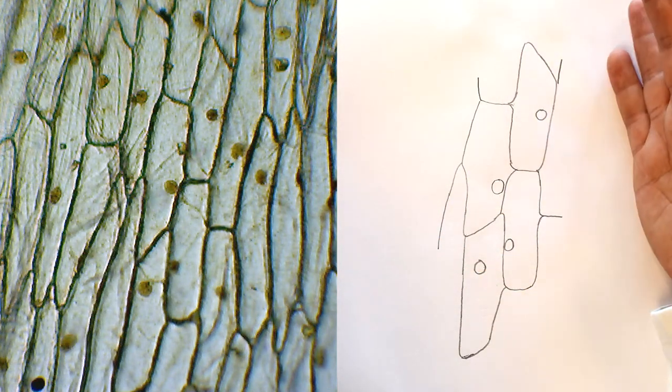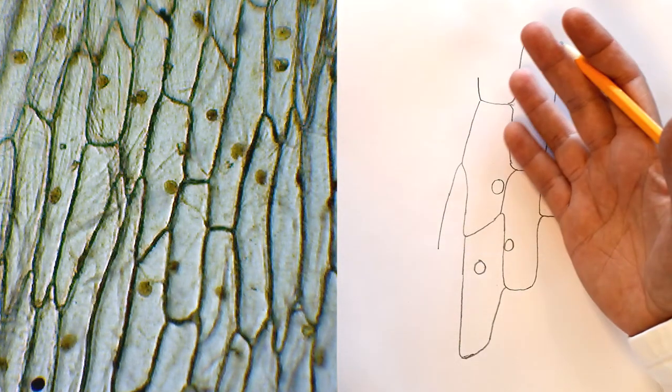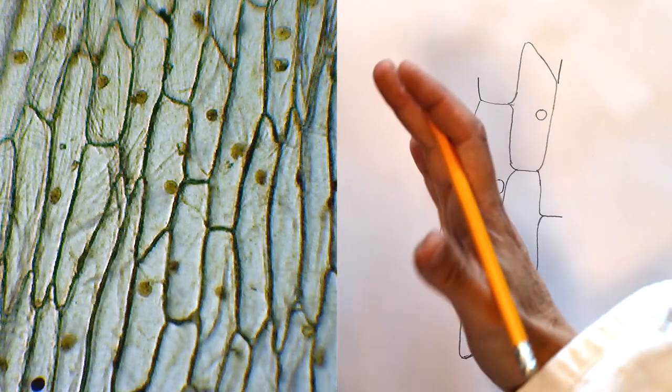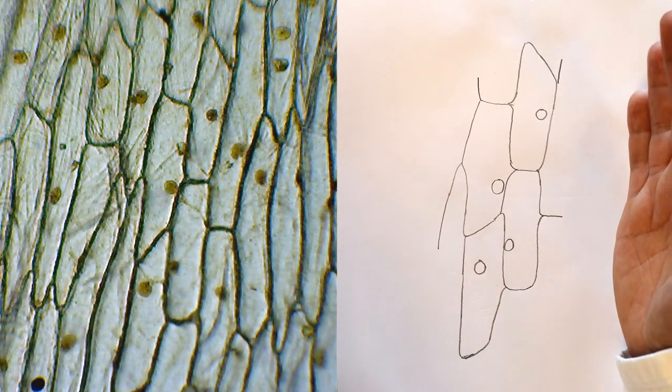I can't see the double cell walls. I can't see the cytoplasm. All I can see are the nucleuses and the cell walls. That is sufficient. That actually is a good biological drawing.